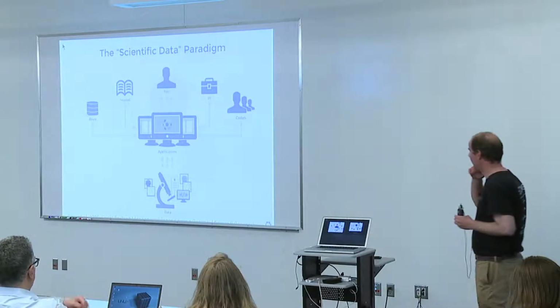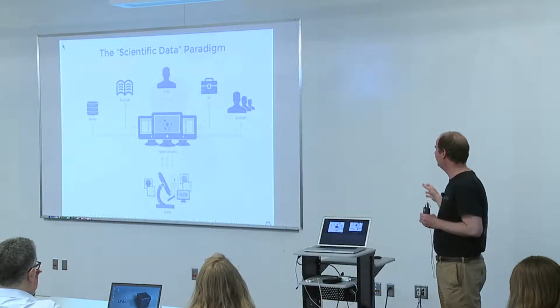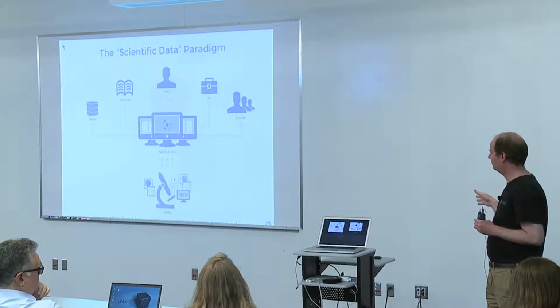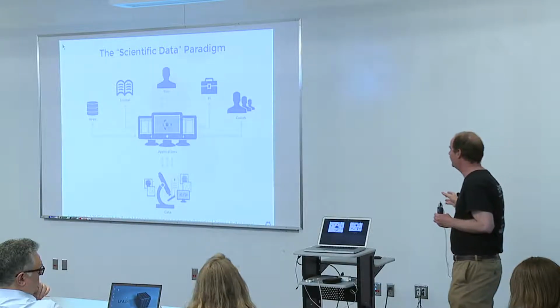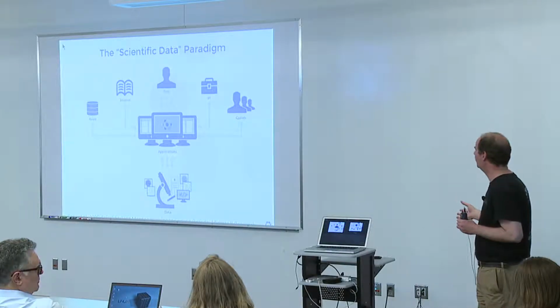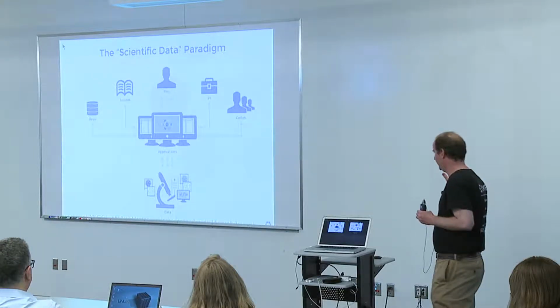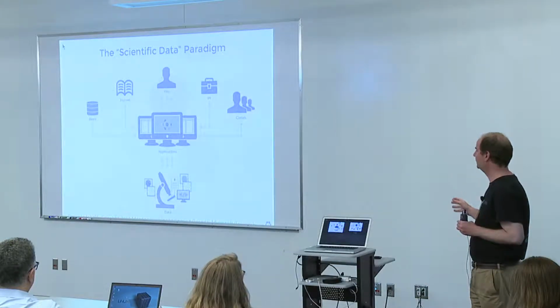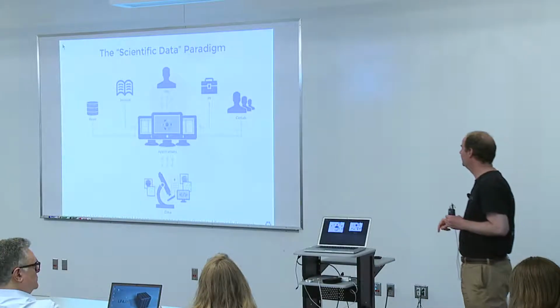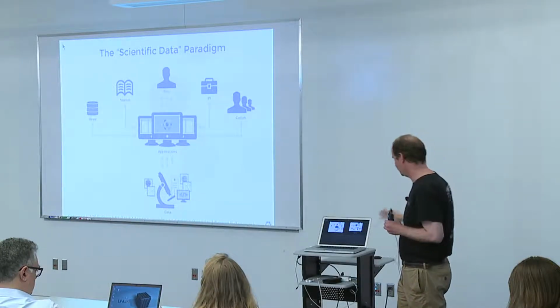Now, we are introducing a new technology which basically binds together things which were not originally designed to talk to each other, and enables the scientists to go through more heterogeneous workflows with bigger data, and allows the necessary image analysis applications to access those data, to store them and to collaborate with colleagues, and so on and so on.